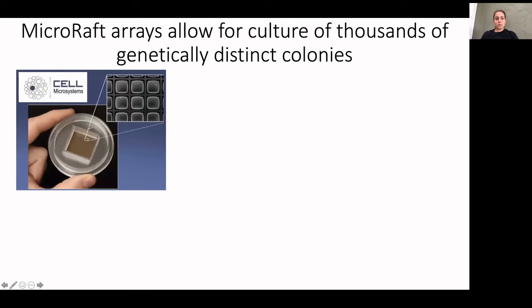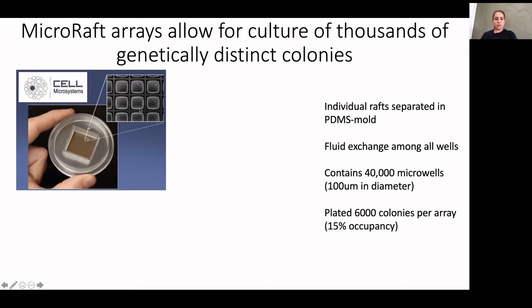to adapt this platform that has been developed by Nancy Allbritton's lab and since commercialized by the company Cell Microsystems, to use microRaft arrays. And we thought that these were really cool because they're quite easy to use. It's a simple cell culture dish with a media reservoir in the middle. However, when you zoom in, what you can see is that this reservoir contains a PDMS array with a bunch of different individual, you can think of as cell culture dishes, physically isolated from one another in space.